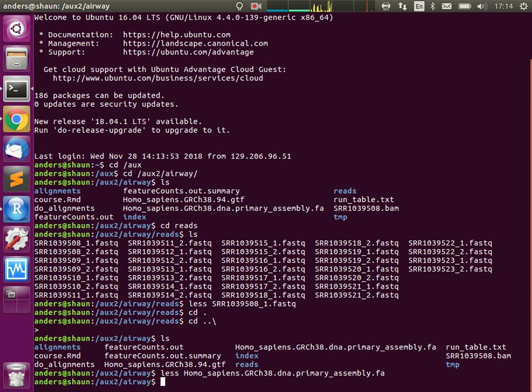And the outcome, what it means for you, is usually two things: speed and sensitivity, and memory consumption. Speed is important because the aligners that we had in our first round of next generation sequencing would easily take hours to align the maybe 10 million base pairs which you got out of a first generation Illumina run. And if we still used something that slow for the 1000 Genomes Project, we would get nowhere. So luckily, a lot of progress went into that in the last 20 years, or 15 years.